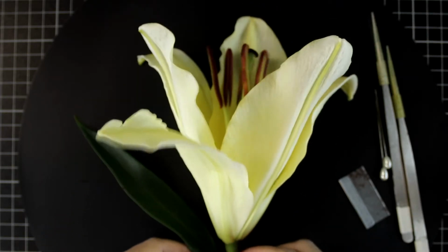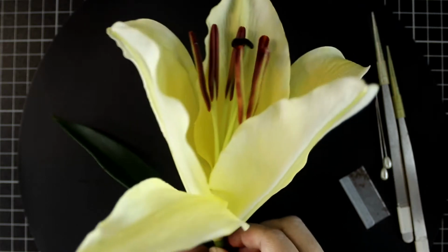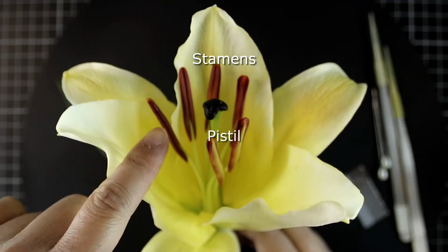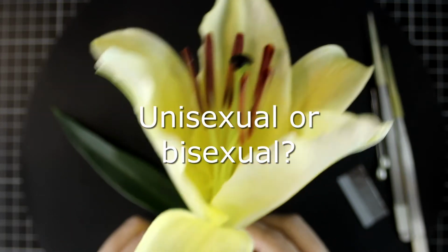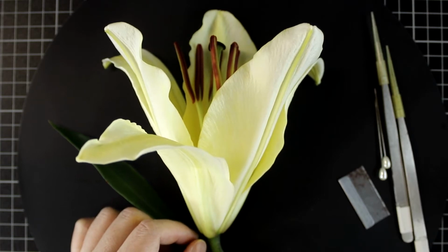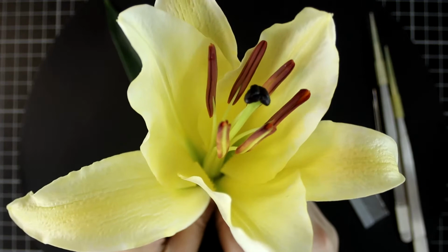So the first information we can get is whether the plant is unisexual or bisexual. And shown here, you can find the stamens and also the pistil. So is it unisexual or bisexual? The second information we can get is about the symmetry. For this information, we need to look at the top view.